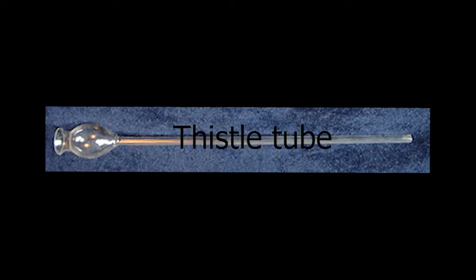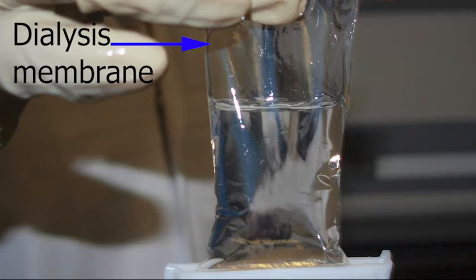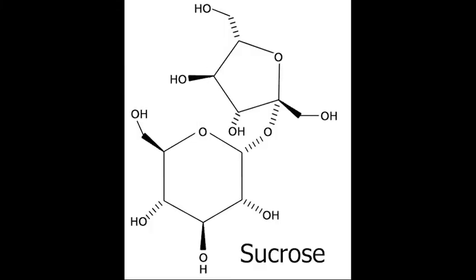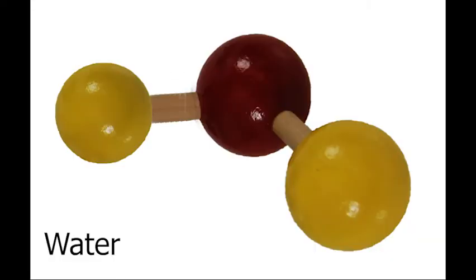In this activity, you will observe the effect of osmotic pressure in a demonstration. A red color sucrose solution was poured into the thistle tube and dialysis membrane was placed securely over the mouth of the tube with a rubber band. Dialysis membrane is non-living but selectively permeable, like a cell membrane. The thistle tube with sucrose solution was lowered into a beaker of distilled water. Sucrose molecules are too large to pass through a dialysis membrane. Water molecules are small enough to move across a dialysis membrane.